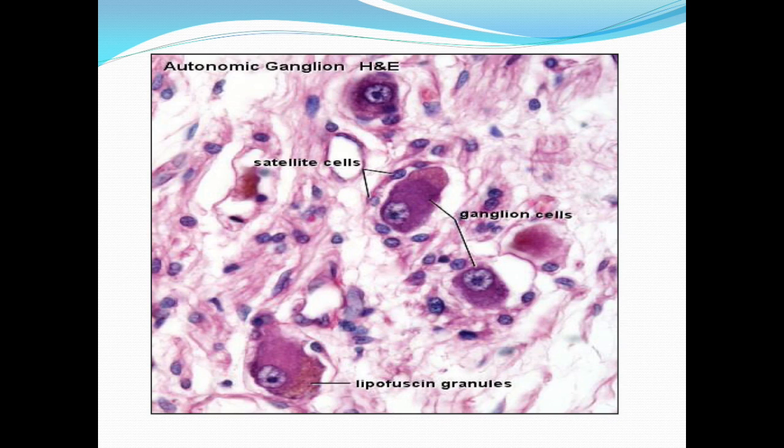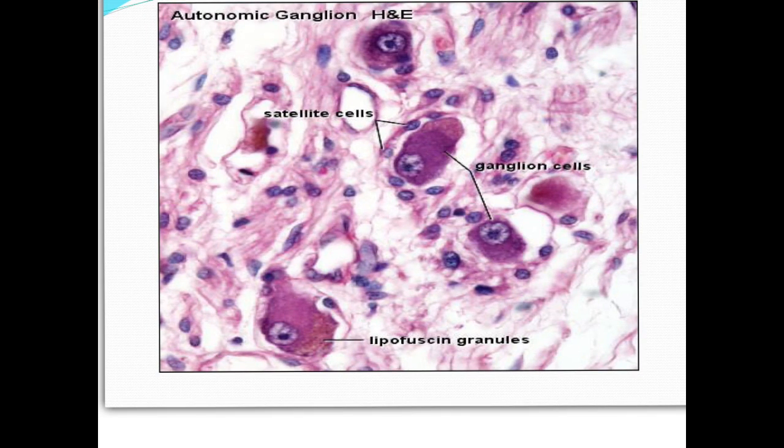Okay, here you can see that we have also in between these nerve cells these red and blue lines representing the nerve fibers. In this picture, you can see that we have many blood vessels. Here, this is one blood capillary with blood, and this is another one.